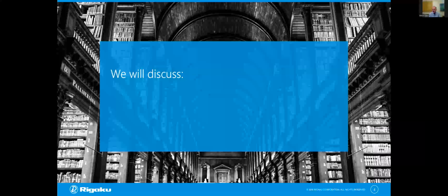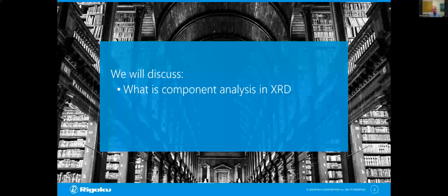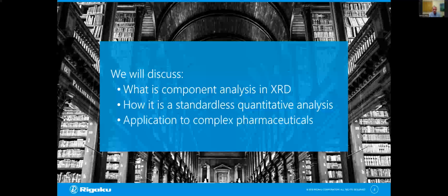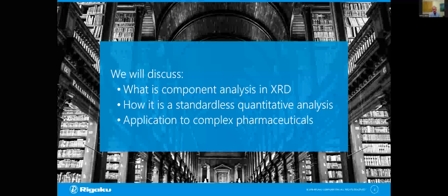Well, thank you, Tom, and greetings to everybody. What we'll discuss today will be component analysis in X-ray diffraction. What is component analysis? How do we use it to understand X-ray diffraction data? And then we'll go on to investigate, is it really a standardless quantitative approach? In fact, it's a fundamental parameters, standardless quantitative analysis approach to X-ray diffraction. And then finally, we'll be applying that to some complex pharmaceuticals to see how it all works out.